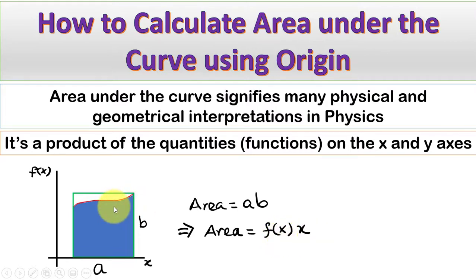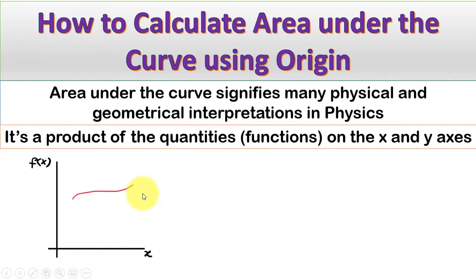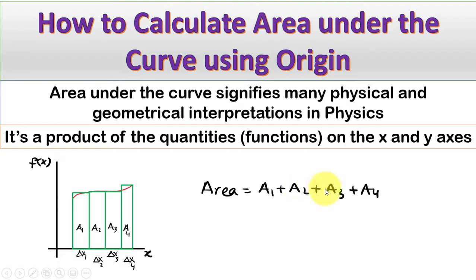But here I know that I have calculated an additional area, which is this one. I can remove this additional area by considering small rectangles here. I will cover this whole area under the curve with respective areas of the rectangles A1, A2, A3, and A4. And the total area is equal to this. And in terms of f(x) and x, I can write it like this.